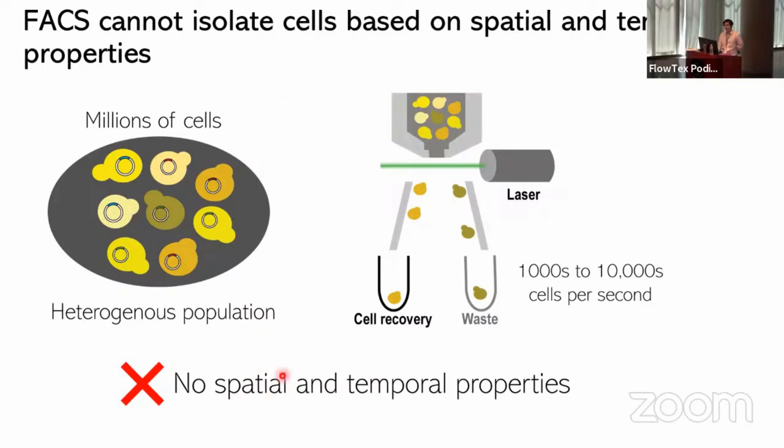I think people are working on this. Now we can do some level of spatial information, and I think BD is releasing a new device, so let's see how good the spatial resolution is. But usually when people want to study spatial and temporal properties, they go and look at microscopy.